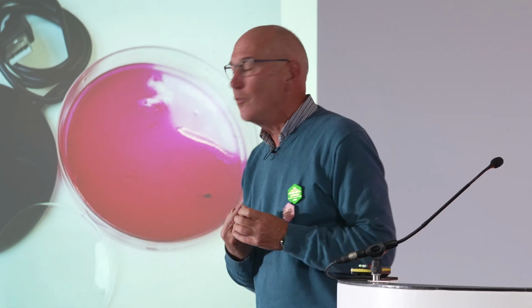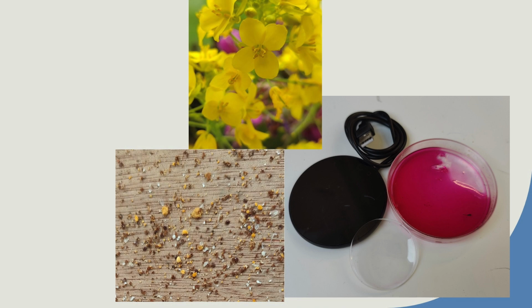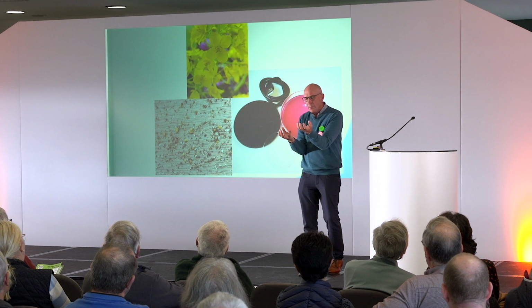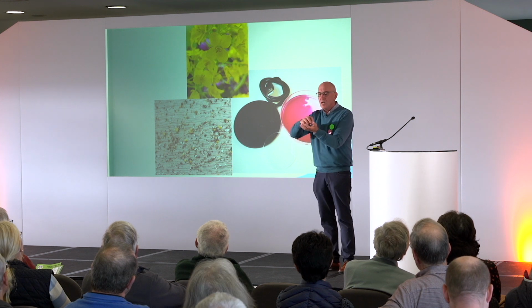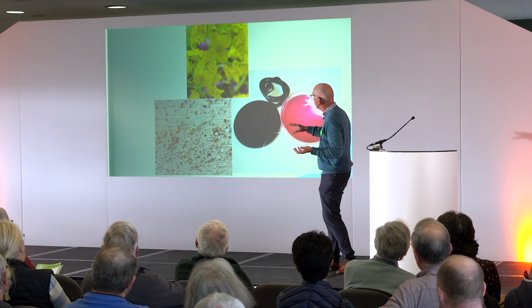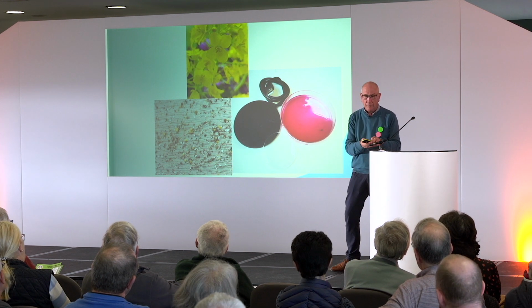Though if you want to find out what's in the honey, just put your Varroa board in, collect your little bits of pollen, put that into the watch glass, and mix it. But the problem is, the bees compound it. There's lots and lots of pollen in one of those pollen loads, and you've got to put lots of alcohol to break it up. But once you've done that, that works, and you know what you've got.